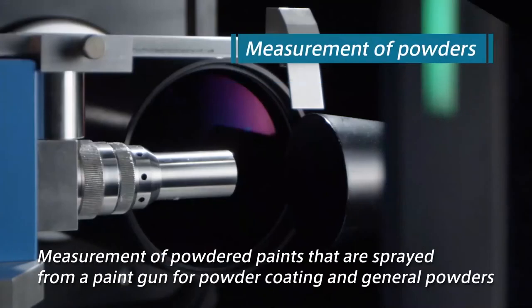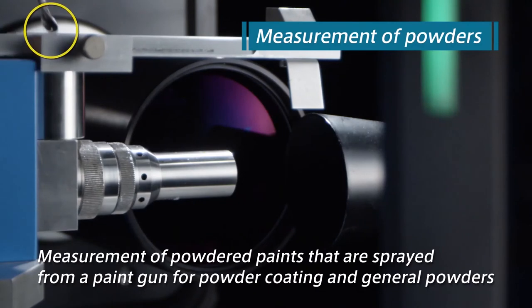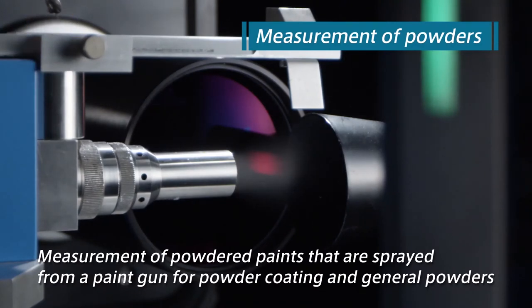Measurement of powders. Measurement of powdered paints that are sprayed from a paint gun for powder coating and general powders dispersed from a dry powder feeder are perfect applications for Aerotrack 2.